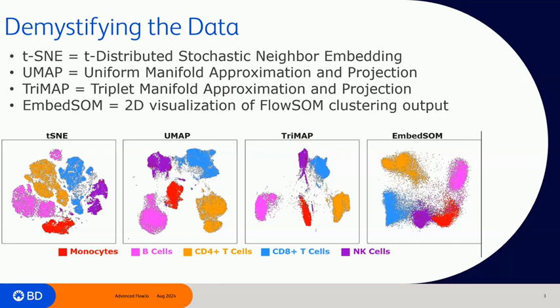Dimensionality reduction techniques like t-SNE and UMAP are essential for visualizing and understanding this complex data. And understanding how to analyze this is crucial for researchers and professionals in various biological fields. Again, today we'll focus on key data analysis aspects that underlie effective interpretations.